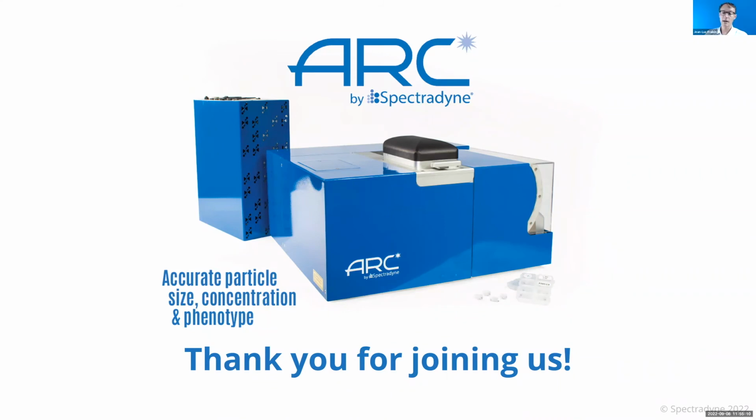No, that's great. I'll just point out, if you're worried about the EVs changing size from a specific marker that sticks to them, you could spike in something of a constant size into the sample measurement as a reference. And then when you do that, you become very sensitive to changes, but you can account for those also, right? So we're happy to talk about that in more detail also.